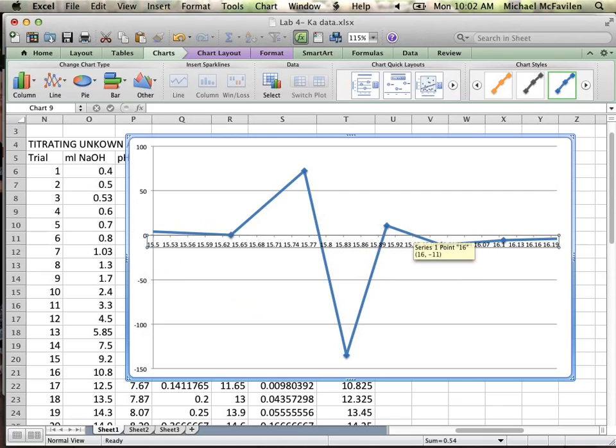Any ideas? One of the problems with this is that your data through there is going to be rife with error. A very small change in the volume can make a very large change in the pH. It becomes more difficult to interpret. We want where we get the most dramatic shift, which in this case would be here. So I would pick that value to be the crossing.